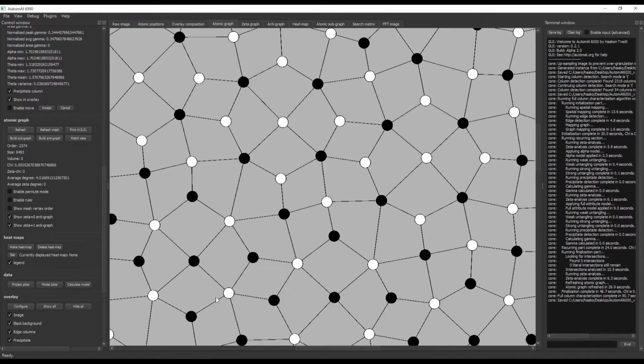I have very rarely seen any counterexamples where all the arcs are symmetric, but the structural information or the species information is actually wrong. This can happen in some images where there are big smears or very ambiguous positions, or very disordered areas.